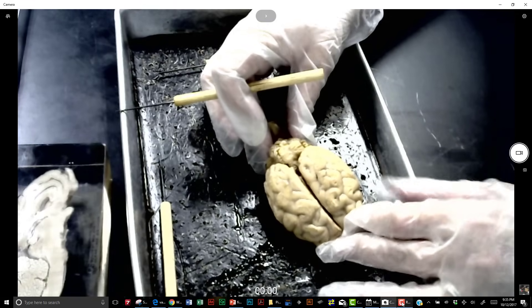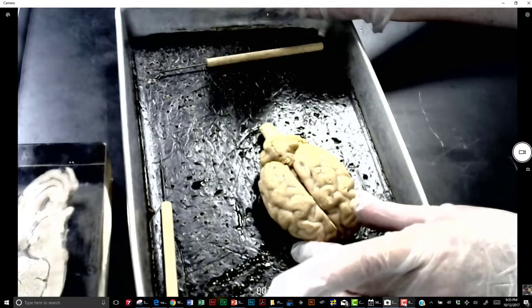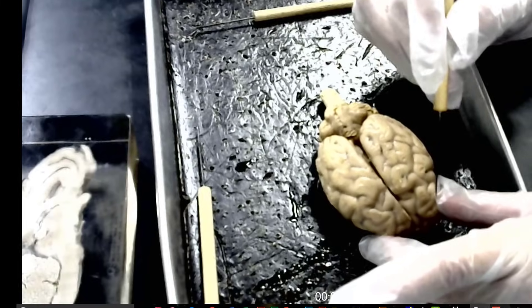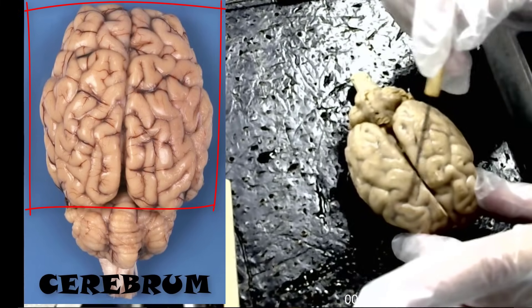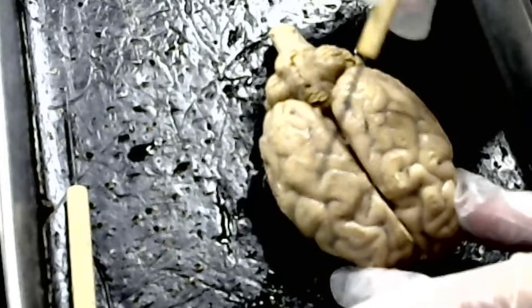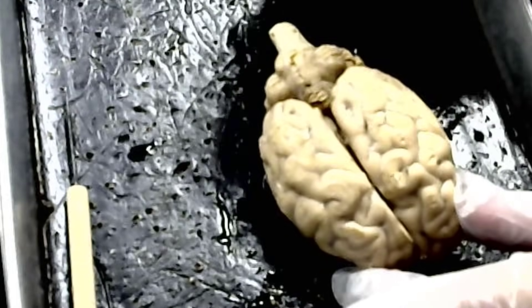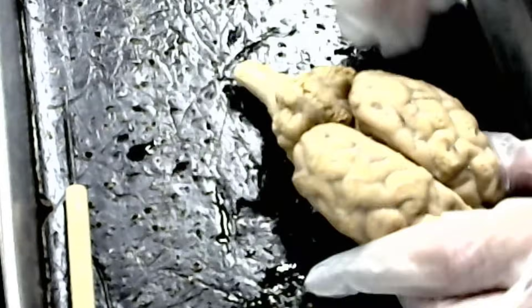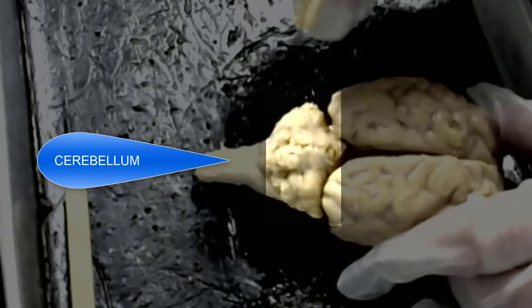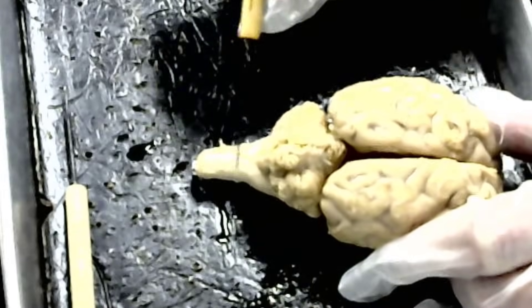This one's kind of falling apart because I have it cut, but it would normally be a little bit more put together. So there are three general regions of the sheep brain and our brains too. This main area here is the cerebrum, and the outer part of the cerebrum that has these hills and valleys would be the cerebral cortex. This structure here is the cerebellum, and this here is the spinal cord.